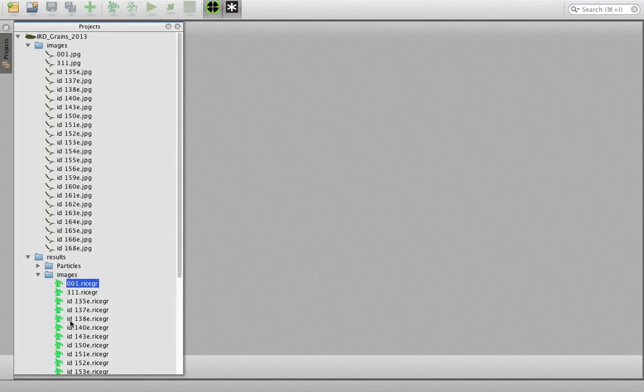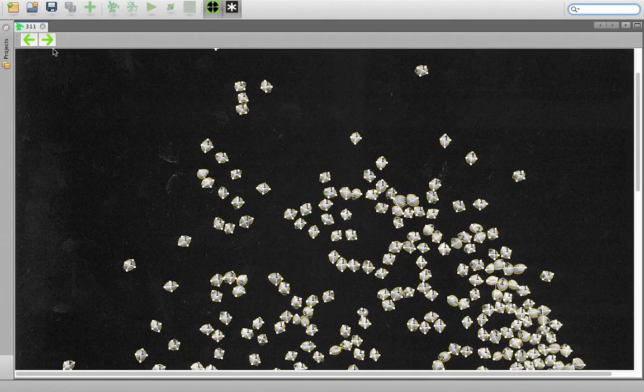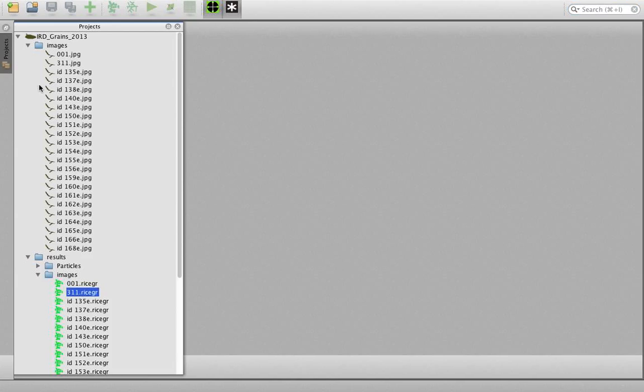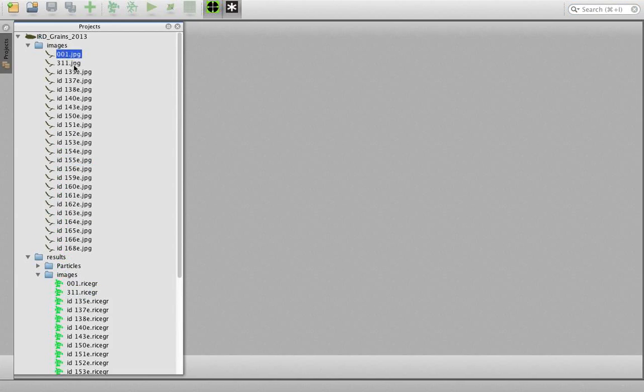Once you have done that, you can collect the reports again if they have the same scale, or if they have different scales, you can move them to another project and define their scale, then run the reporting. Once you have done the processing in the inverted mode, it's recommended to go back to the normal mode.